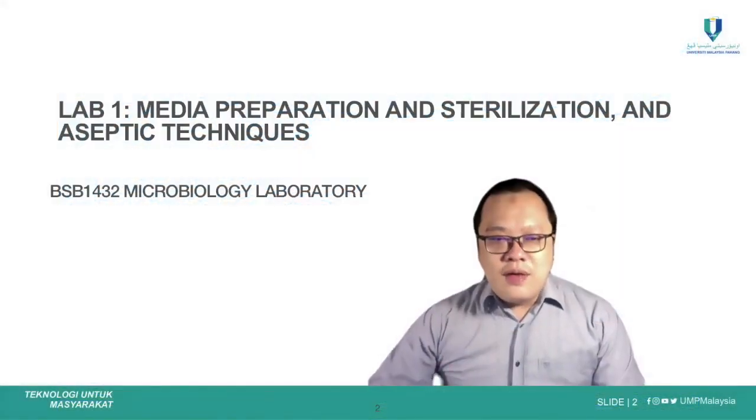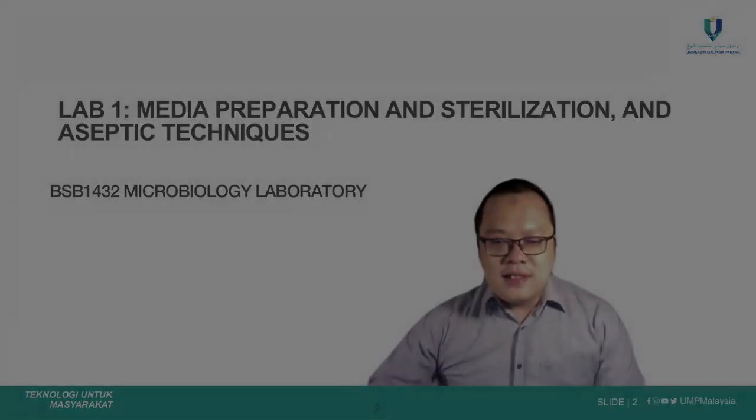Everybody, today we're going to start with our first lab for the microbiology lab. Today we're going to prepare media, sterilize, and perform aseptic techniques.